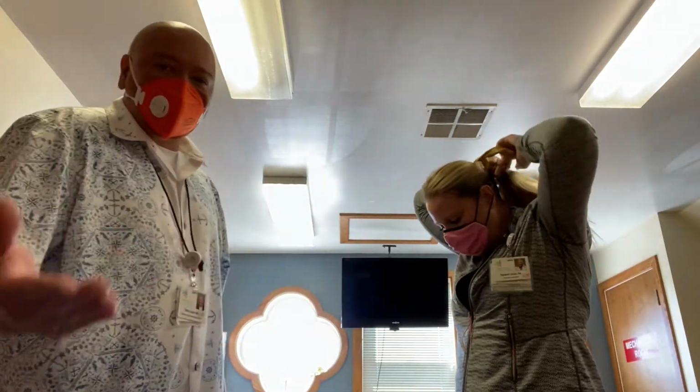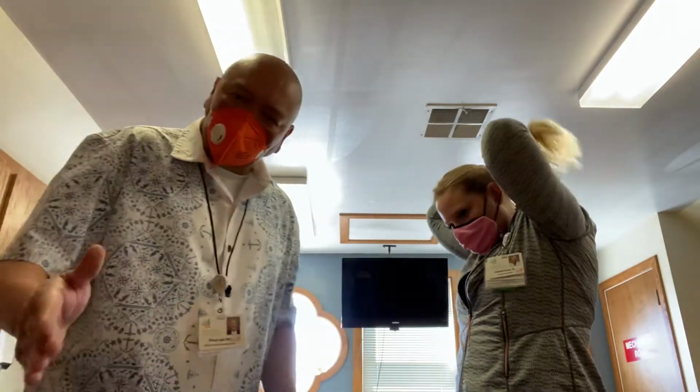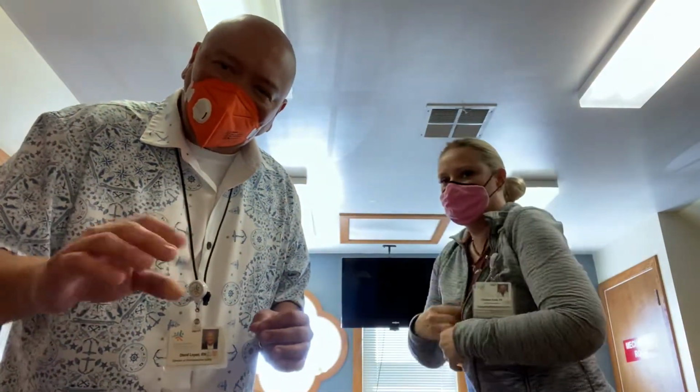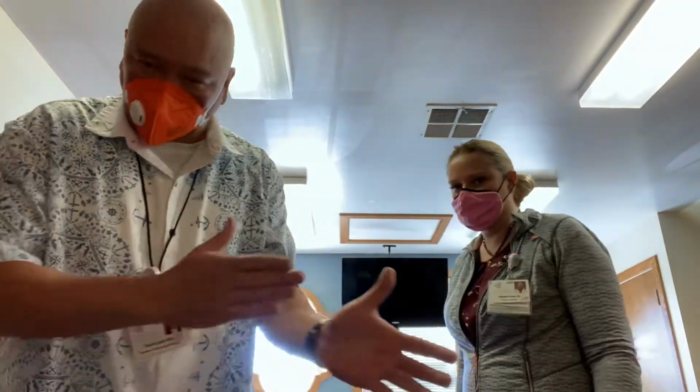So make sure when you don this, make sure that you have all the proper gear. Now, I would advise when you're wearing PPEs, I would want you to wear clothing that is breathable. If you don't do that, you'll have a lot of sweat because sometimes the gowns vary and you will sweat it out. So wear comfortable clothing underneath the PPEs.